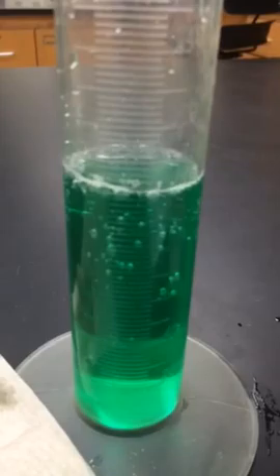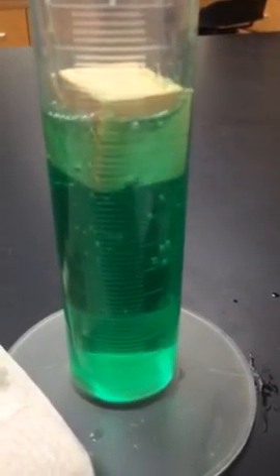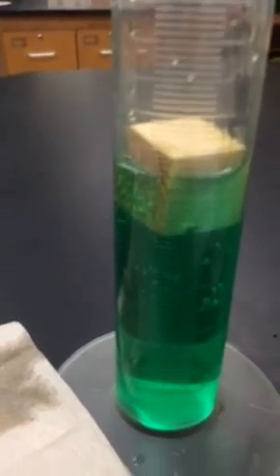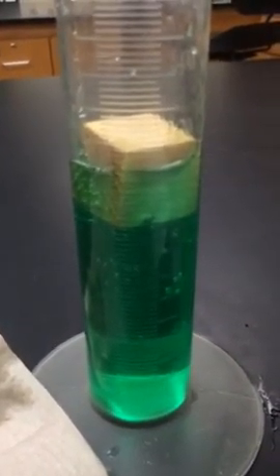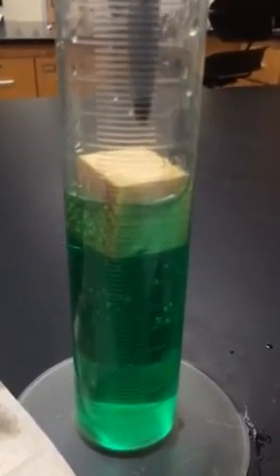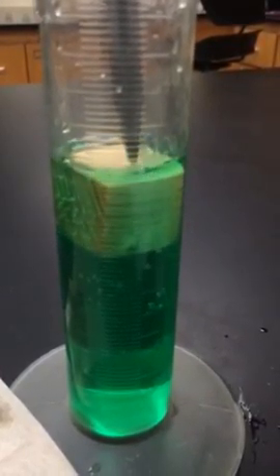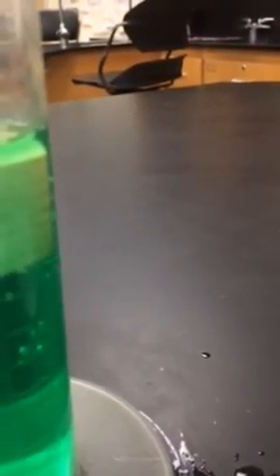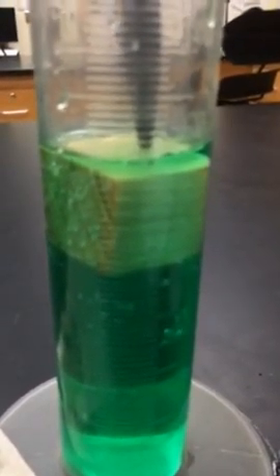We're going to take our cube, and this time we'll be able to drop it in. Okay, now if you notice, my cube isn't all the way under the water. To get the volume of the whole cube, I'm going to have to take my pen or pencil and just push it a little bit under and then take my reading. Okay, so I see 110, 12, 14, 16.